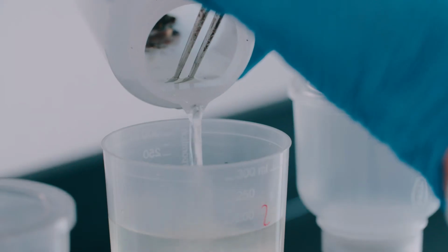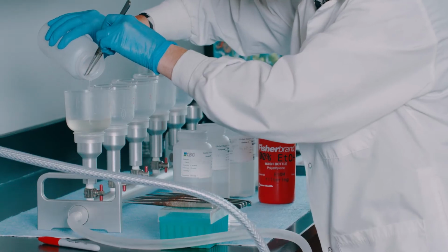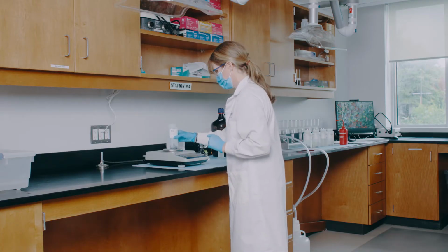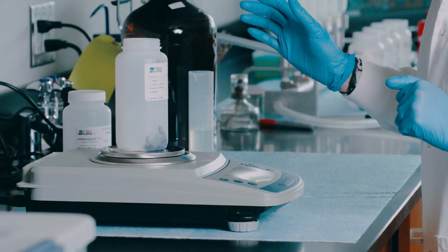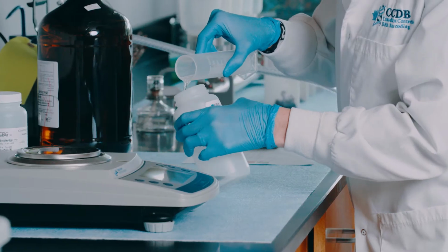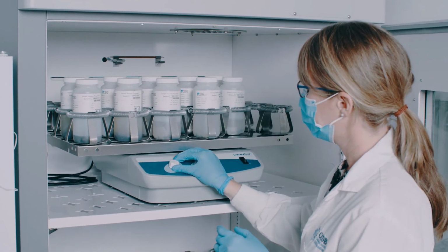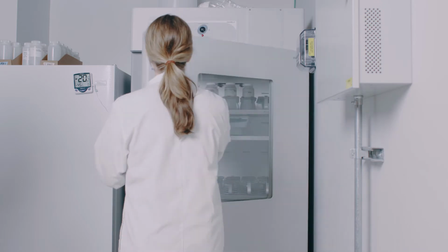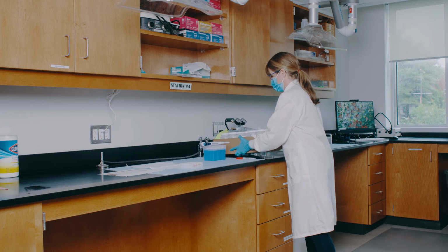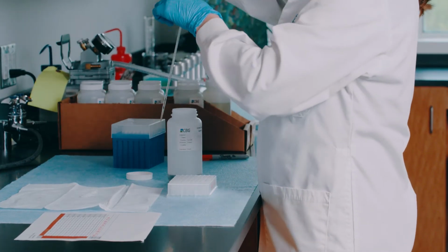The insects are collected passively into a bottle with ethanol. The first step is to remove the ethanol from the bottle. Then, the insect sample is weighed to estimate the amount of lysis buffer to be added. Once the buffer is added, the bottles will go into the incubator on a shaker at 45 degrees overnight. So the next day, our bottles have all been lysed. Now, we'll replicate our plate map and sample our lysate into this round well block with a serological pipette.